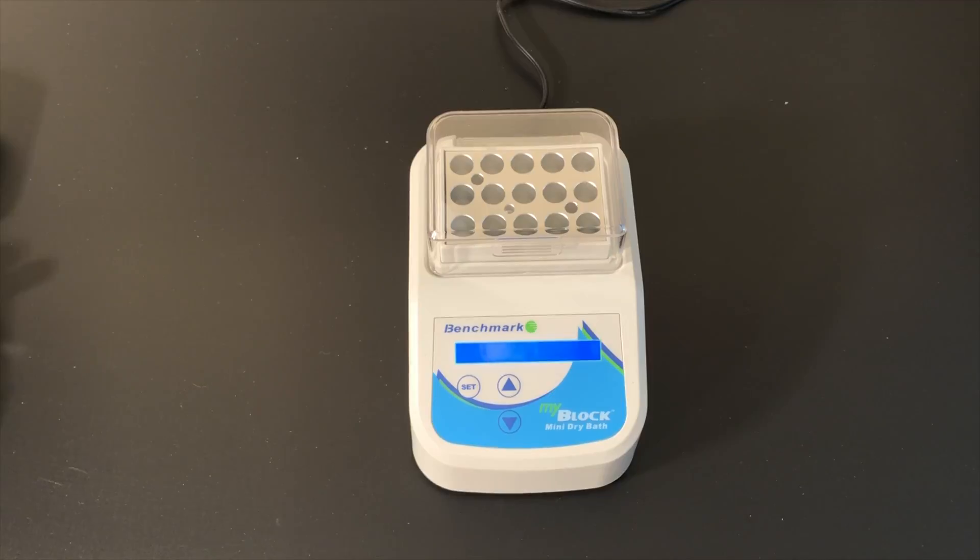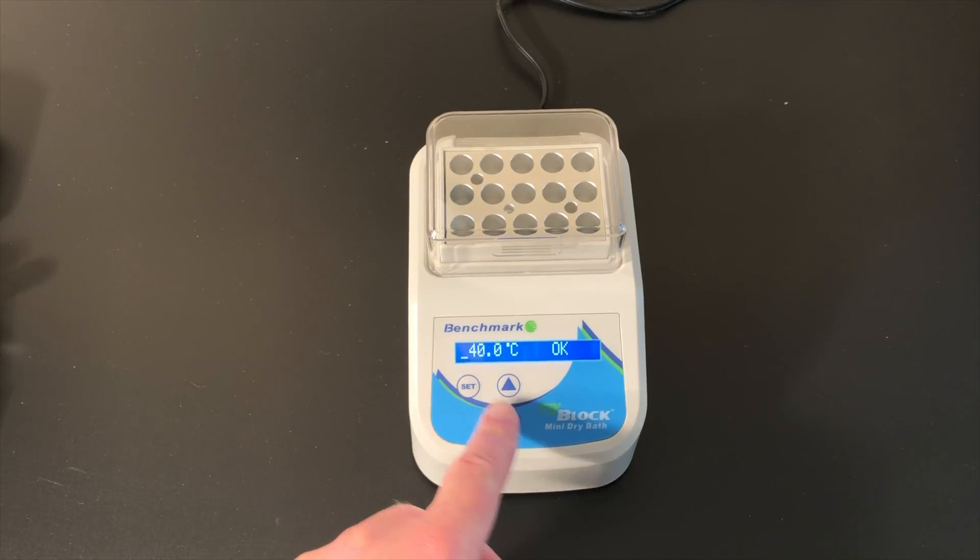Turn on and set the Mini Incubator to 40 degrees centigrade. Let the incubator warm for about 10 minutes or until the screen displays OK.